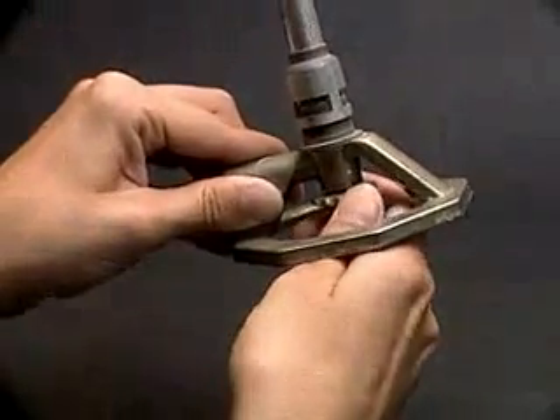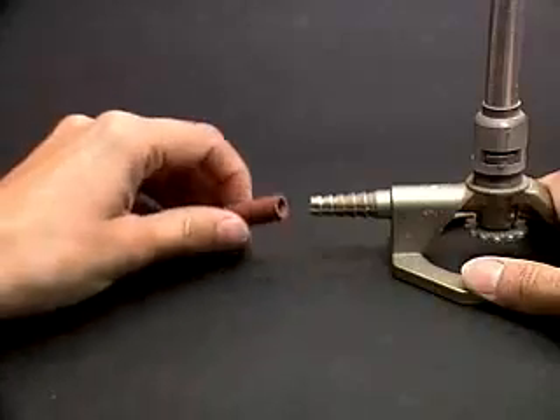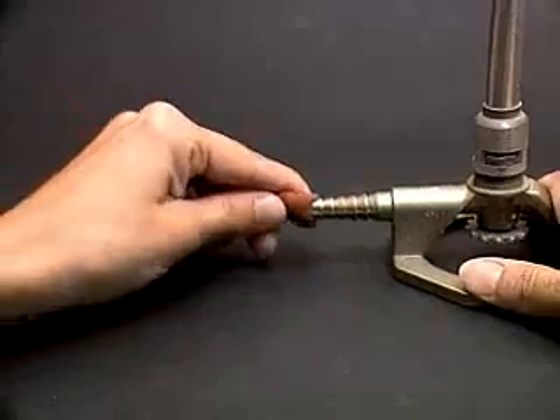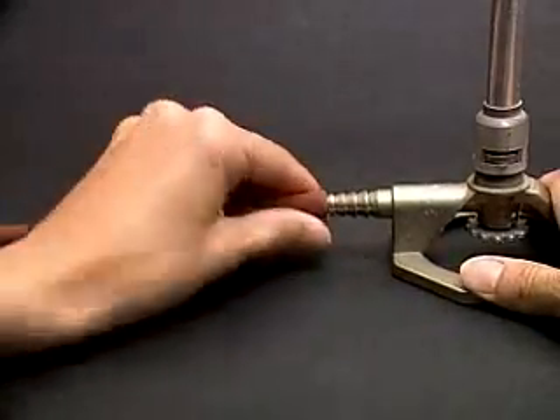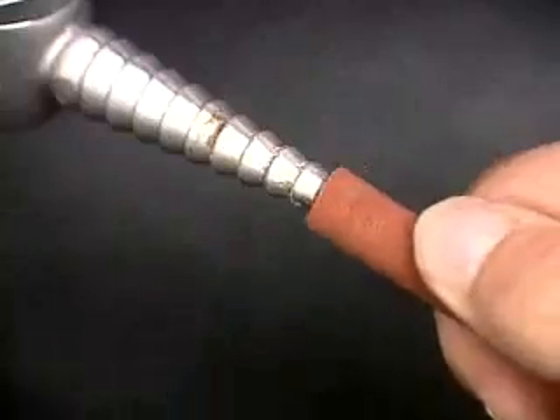Close the needle valve. Connect the tubing to the gas inlet nozzle on the burner and to the gas outlet nozzle at the bench.